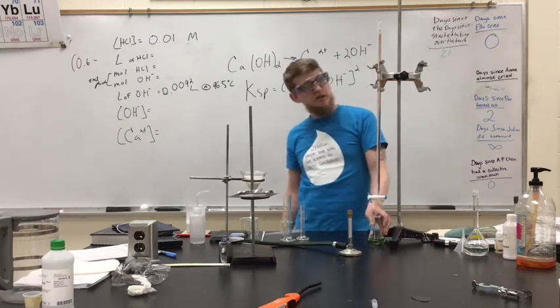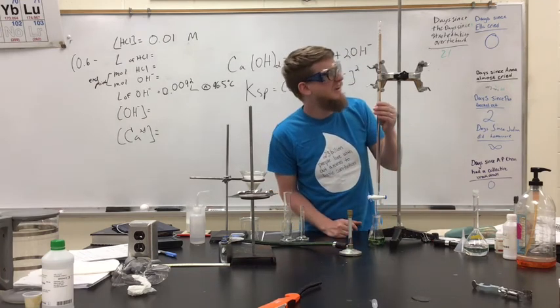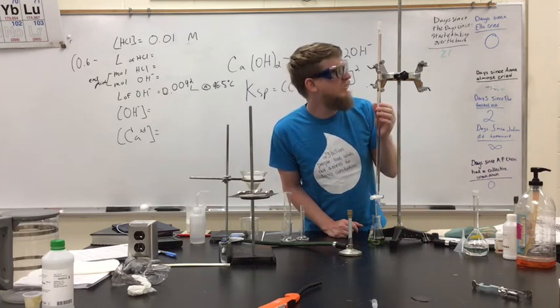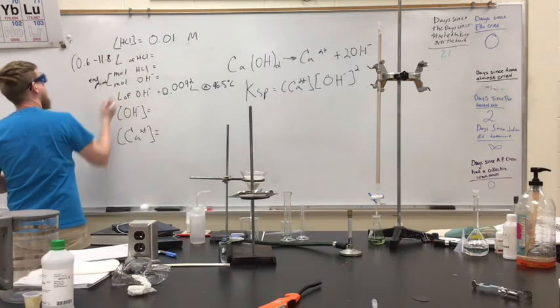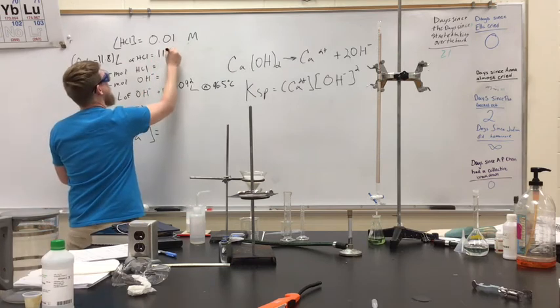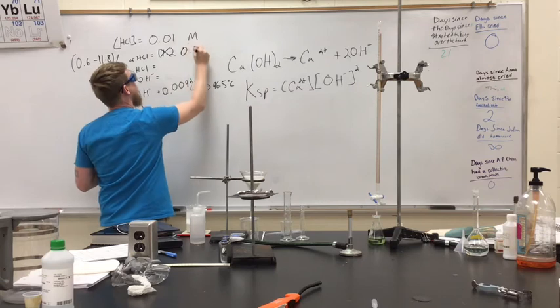All right, there we go. Much less this time. And I have to get up here to look at it. It doesn't even look like we got down to 12. It looks to me like we're at 11.8. 11.8 milliliters. Right? So the total volume that we used here was 11.2 milliliters, which we're not going to use. We're going to use it in liters like this.